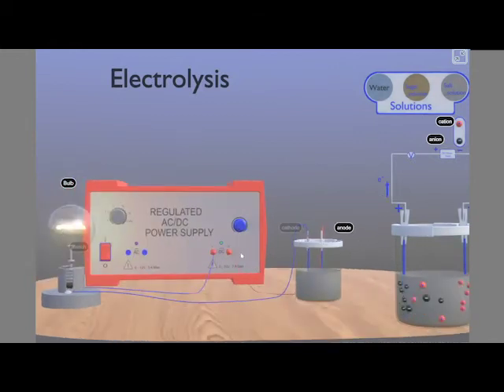And there is another thing very interesting here. You can see now the light bulb is producing light. Why? Because electricity is being conducted. So a salt solution is a good electrolyte. It can conduct electricity. You can even see that on the diagram, the electrons are moving. You can see the light from different angles.